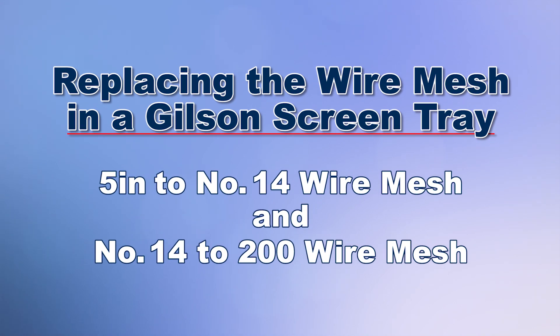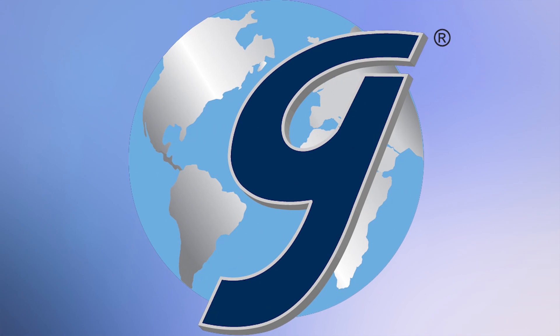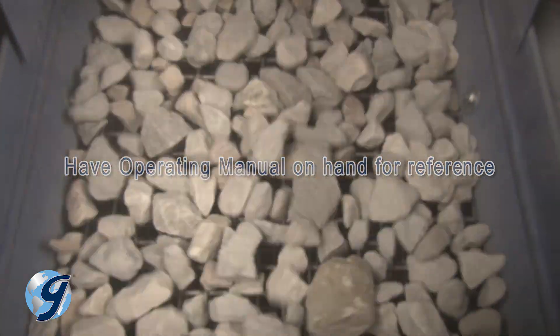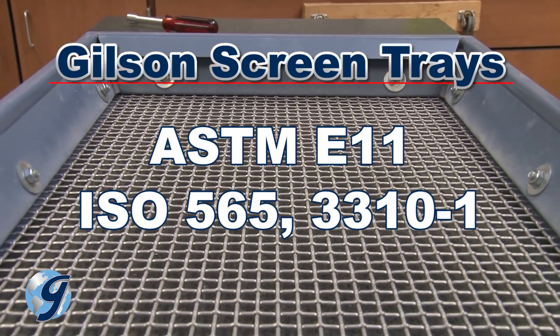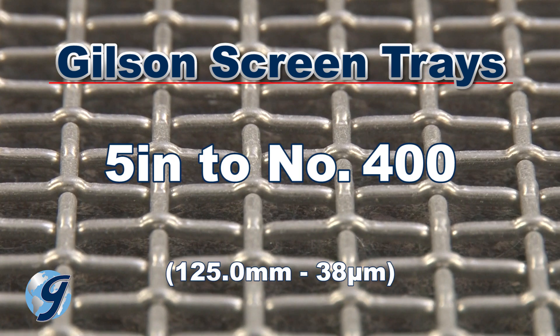Today we're going to demonstrate how to replace the wire mesh in a Gilson screen tray. The Gilson testing screens are rugged, tough machines that will provide years of service for your accurate particle size determinations. Gilson screen trays are fitted with ASTM E11 or ISO 565 and 3310-1 stainless steel screen cloth with mesh openings from 5 inches to number 400.